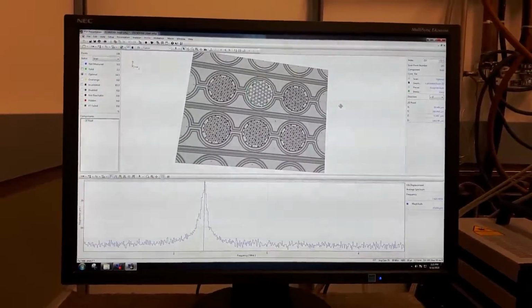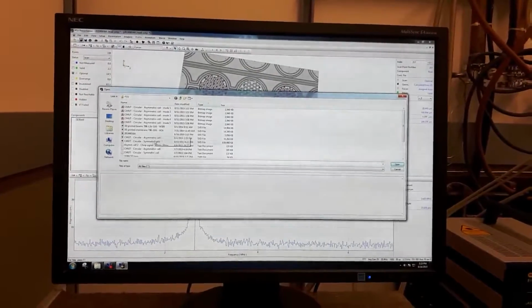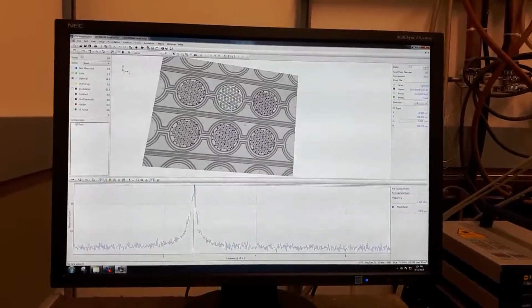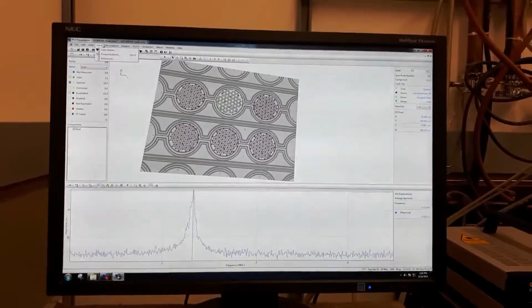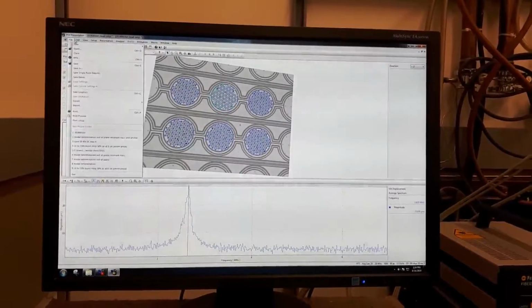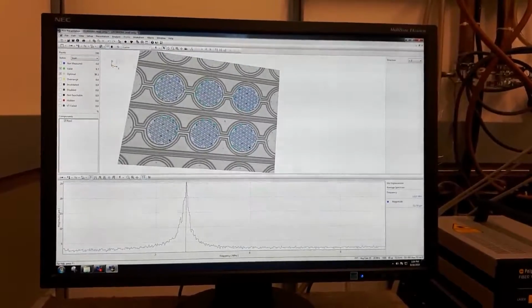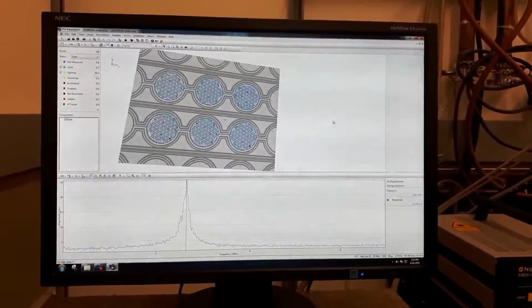I'm going to show you one of the demos. Oh, by the way, extraction of animations, that's important as well. I think it's edit, select all, validate all. Validate, there you go. And I think average spectrum, point, average spectrum.